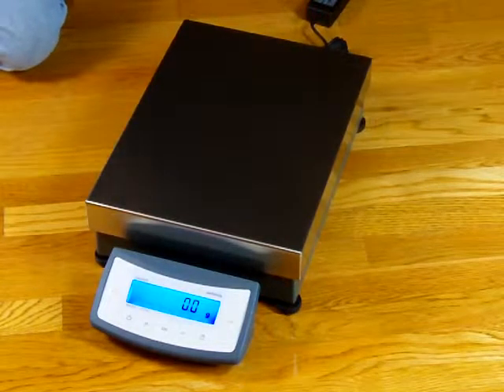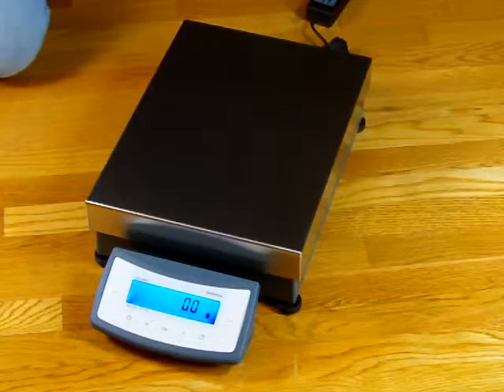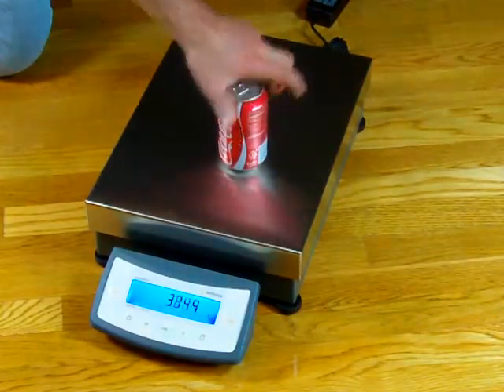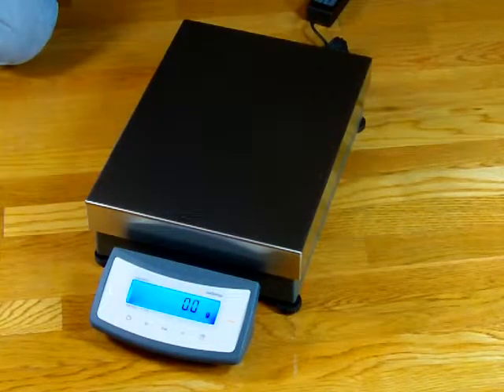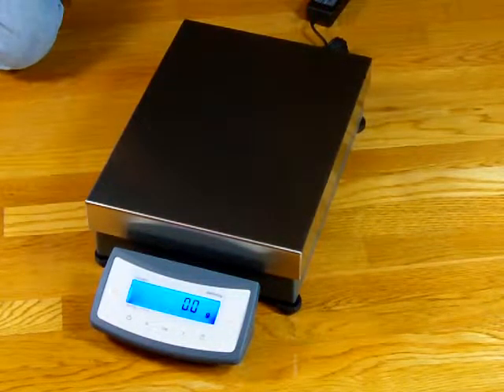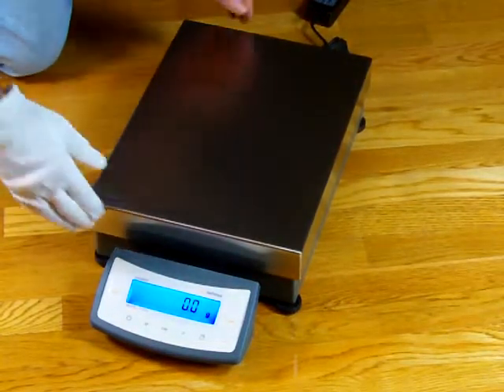I want to show you some more features of this balance. The first thing is the stainless steel platform — again it's very large, 11.8 by 15.7 inches. Here's a tonic can to give you some perspective on how large this platform is. This is a very large scale. A lot of people in the aggregate industry would buy this for super pave applications, or they would sift gravel and stone and weigh each component.